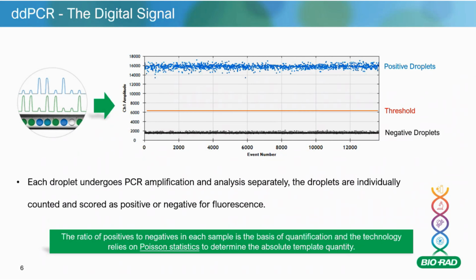Now, the same thing is happening in digital PCR. Your values or your droplets are being assigned either as 1, positive, or 0, negative. And if you look at the example that's given here, remember these little droplets are running through a detector one at a time, and they're each being excited one at a time. And if they contain your gene of interest, i.e. your primer is bound and your probe, then they fluoresce in that color, depending on the channels.